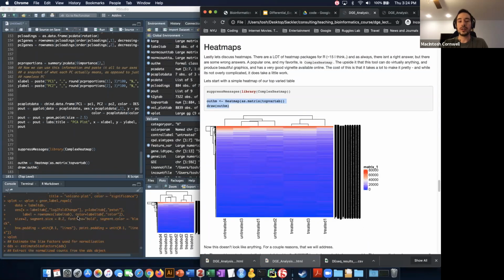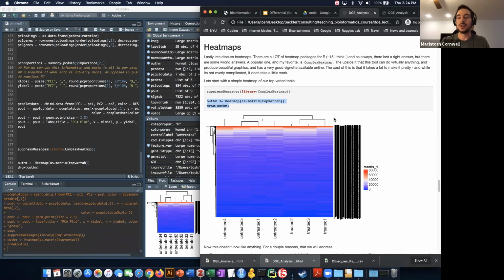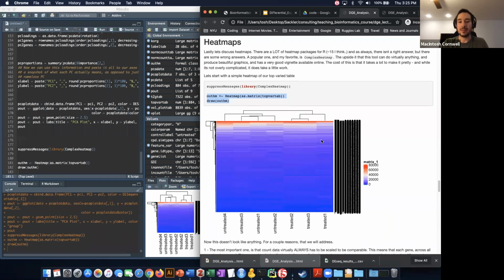But there's also one key thing missing from this, which is a fundamental part of creating a good heat map, which is making your features each comparable across samples locally without globally shifting the whole thing to make it unreadable. So what do I mean by that?